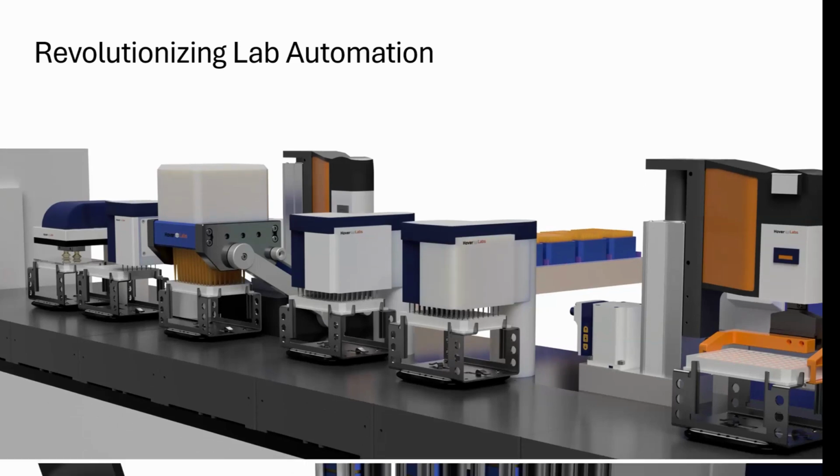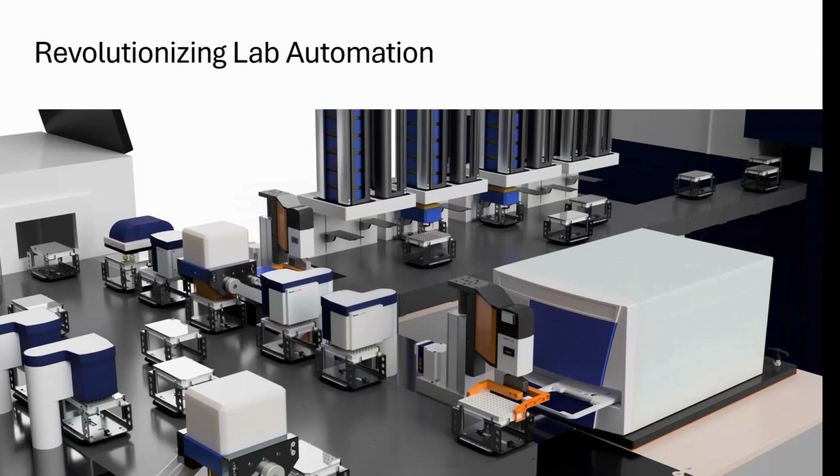Click, please. This approach represents a paradigm shift in lab automation, one that embraces the concepts of industrial automation while meeting the complex needs of the lab in new and more interesting ways. It releases us from a lot of the constraints and limitations that are associated with traditional lab automation design scenarios. Next slide, please.